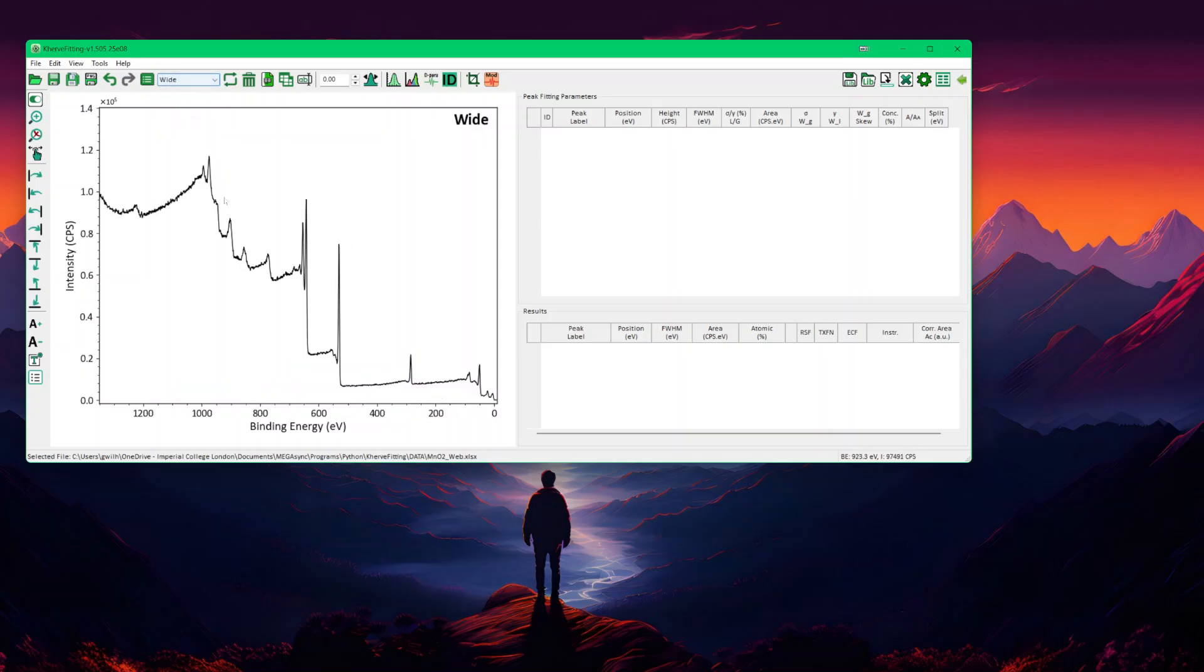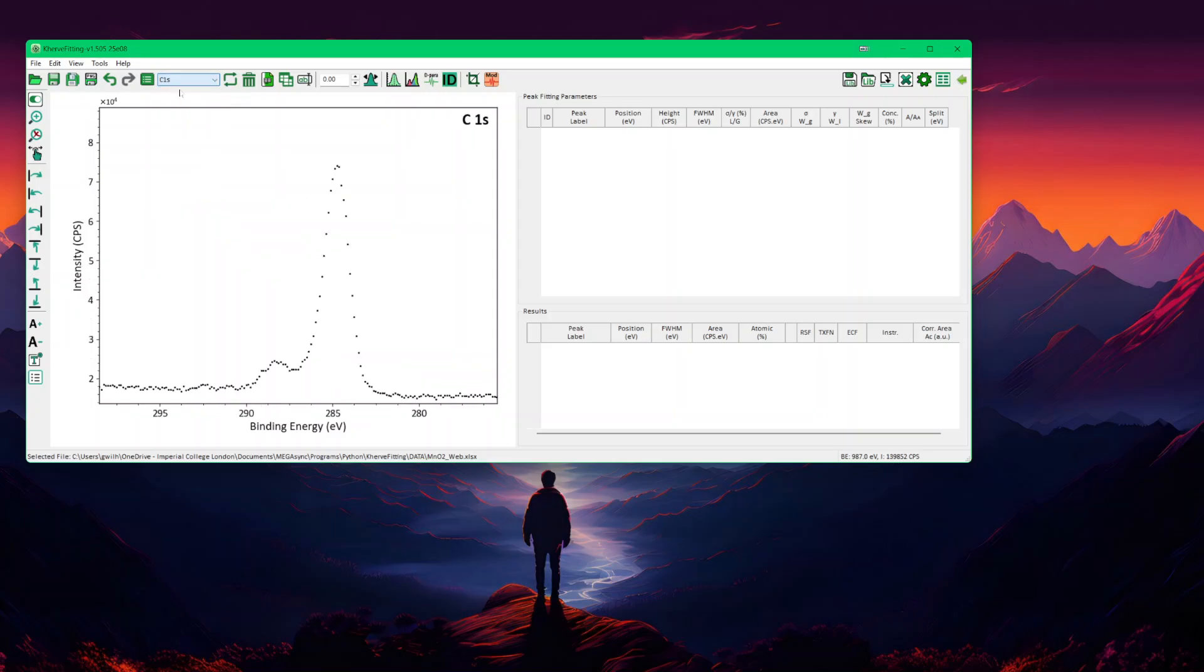In the wide, if we just click there, we get the wide range. At 284, you get the carbon 1S, the oxygen 1S and the MN2P and then some Auger lines. Usually we start with fitting the carbon 1S that we would then use for running energy correction.